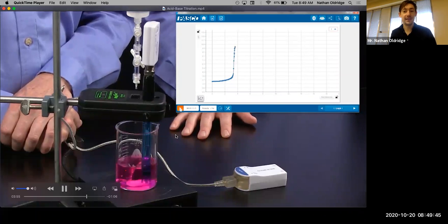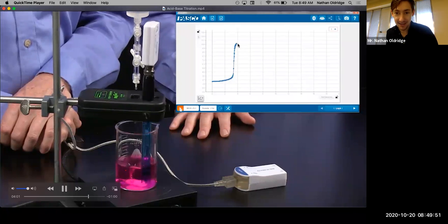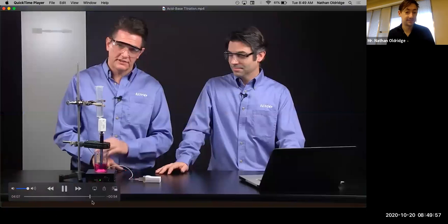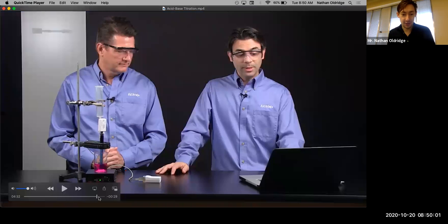Anyways, he's gone way overboard. He started at a very acidic pH. It's blasted through the equivalence point, and he's now solidly in base territory. His pH is above 10. That's wild. Don't drink that. He's pretty impressed with himself. I think they're probably going to do it.